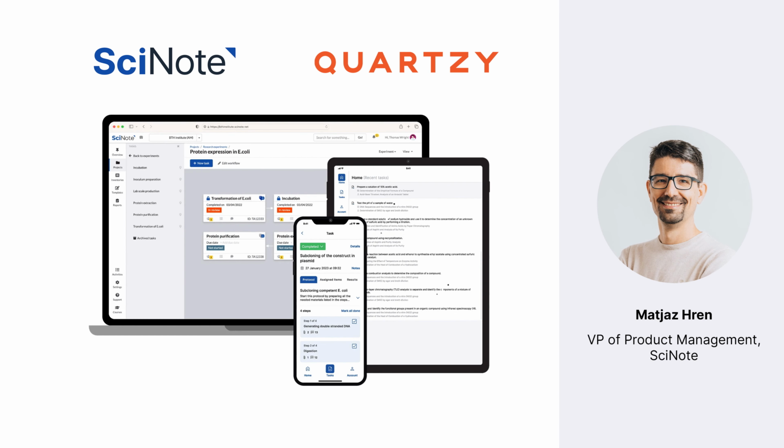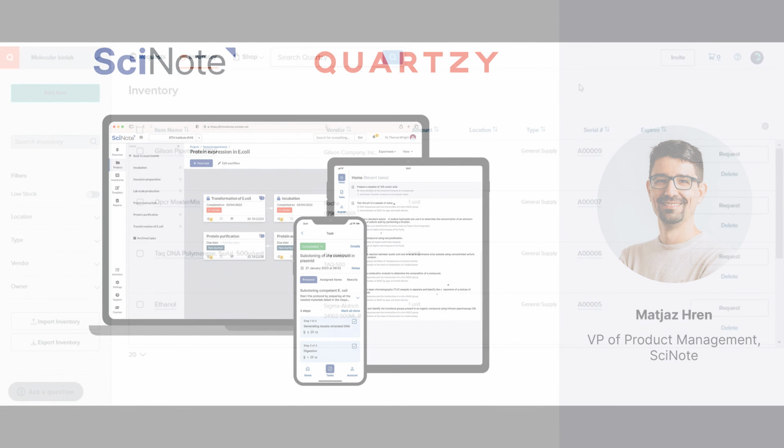Today we are sharing a seamless integration between Quartzy and SciNote. The integration is connecting the best the two platforms have to offer. SciNote is an online data management platform focusing on experiment management, inventory management, compliance, team management, and collaboration. Quartzy is also an online platform that covers end-to-end management of scientific research reagents and supplies.